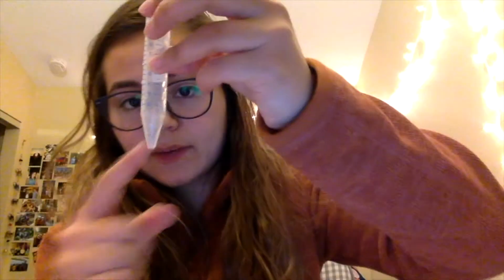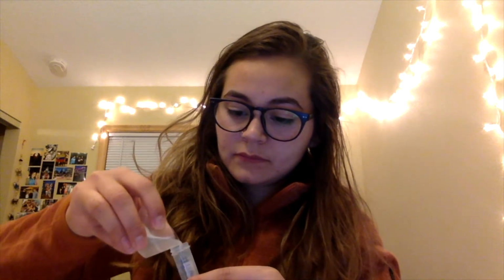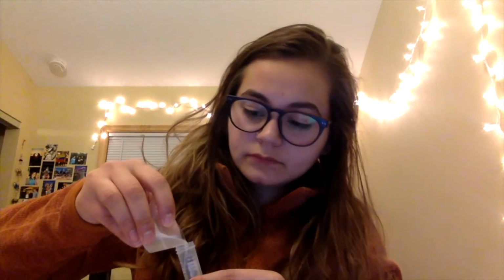Now you're going to take your medicine cup and your conical tube with the dish soap, the one that was in the ice with the dish soap, and you're going to pour your spit slowly. Alright, so when we did that wash in our mouth, pretty much we are getting cheek cells into that spit solution that we had.